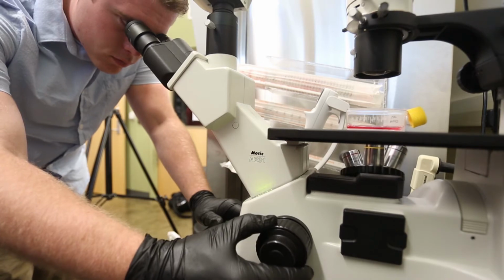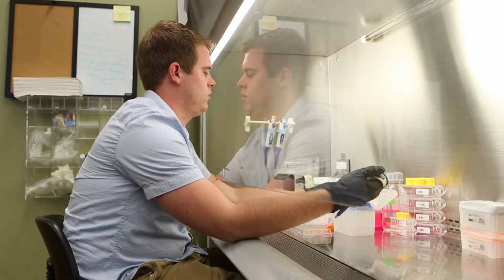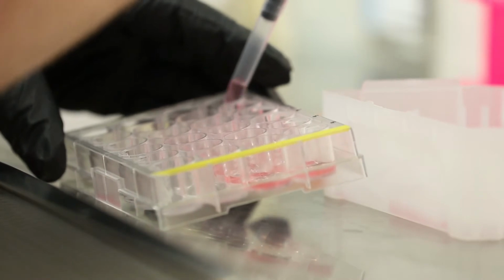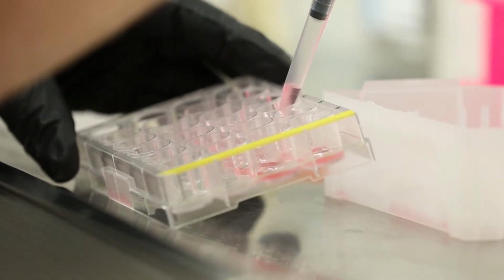And so what we're doing in the tissue culture hood is we have to do it under sterile conditions so that we minimize contamination. But what we do then is we can actually culture them, which means that we can continue to grow them, so we can basically propagate them. But we also use the tissue culture hood to transfer those cells to dishes so that we can actually do experiments with them.